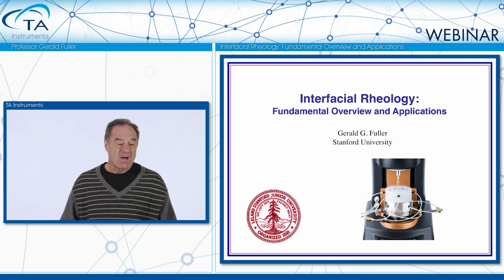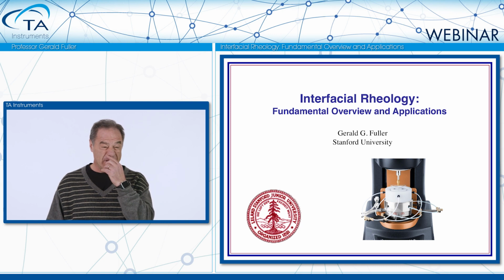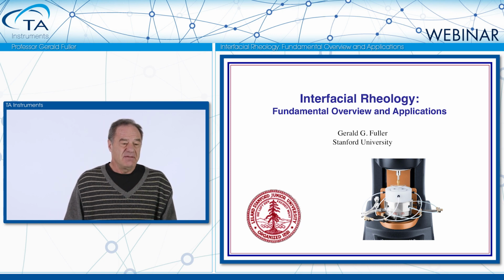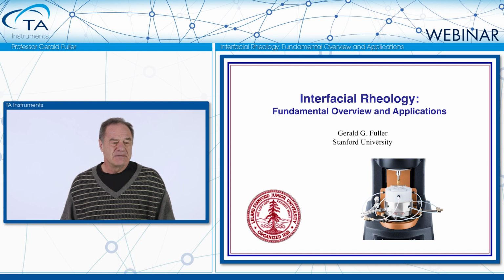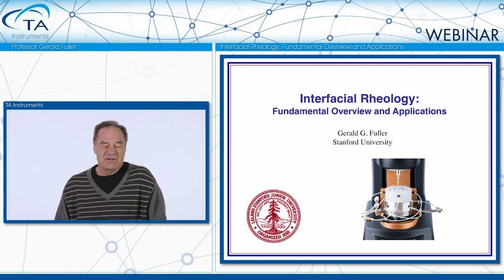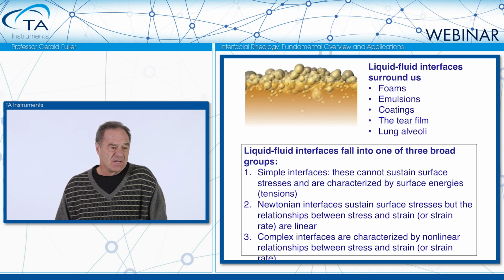So up on the screen, you'll see the workhorse of interfacial rheology that we use in my laboratory and in many other laboratories, and that is the double wall ring. It's attached to a DHR TA rheometer, a very sensitive torque transducer. And so let's start the presentation.